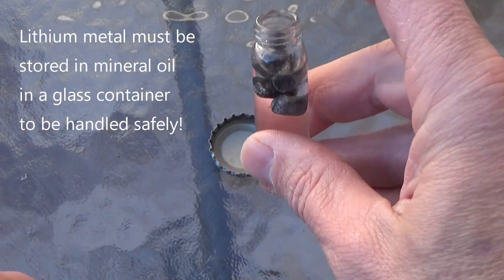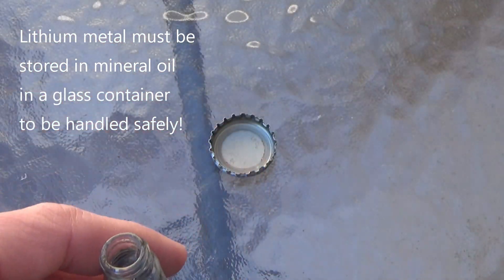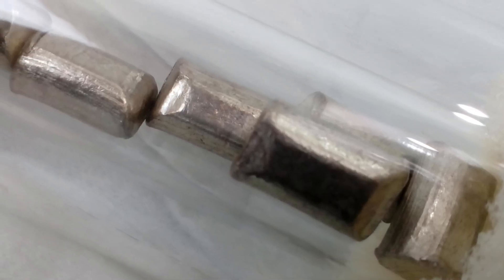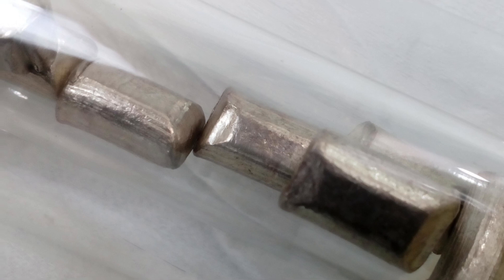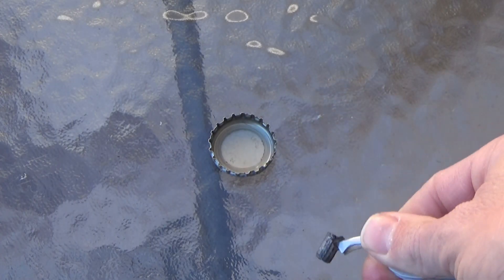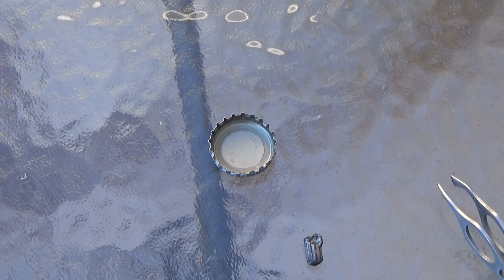In this video I will be putting a piece of lithium metal in various types of liquids. Lithium is the lightest of the solid elements at half a gram per cubic centimeter, making it lighter than water. Lithium is a very reactive metal that reacts not only with the air but with water.